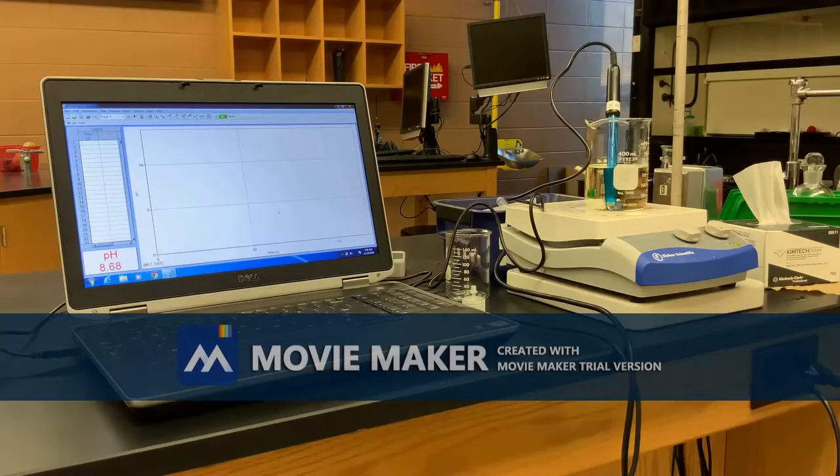And so right now it's jumping and it's very unstable. So we're gonna wait a little while to see if it stabilizes. And if not, we're just gonna have to pick a pH that it keeps coming back to.